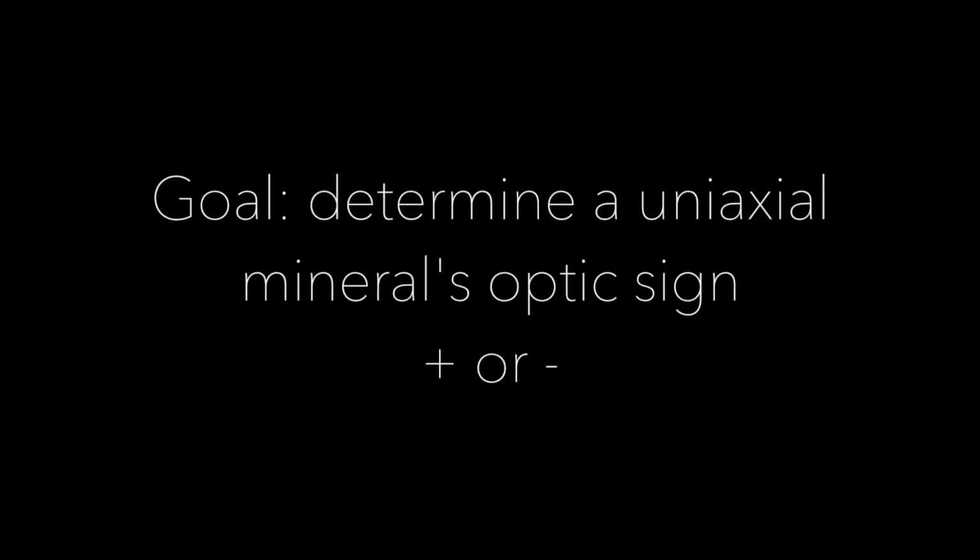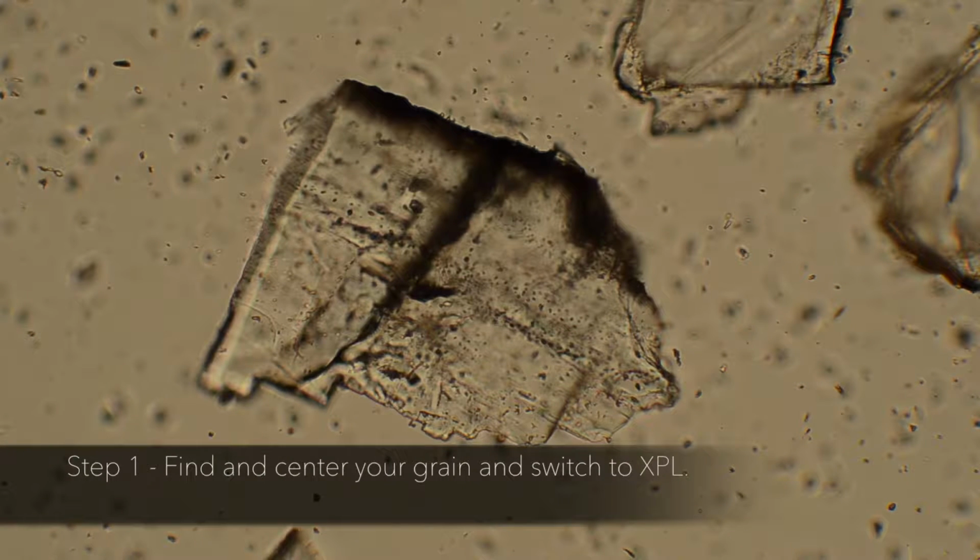Today we are learning how to describe and characterize uniaxial minerals. Our goal is to determine a uniaxial mineral's optic sign, or whether it is optically positive or negative. Note that this is different from having positive or negative relief. Here's how we do that.